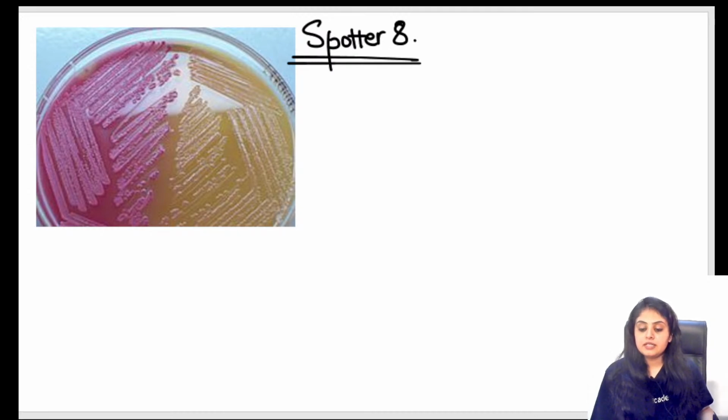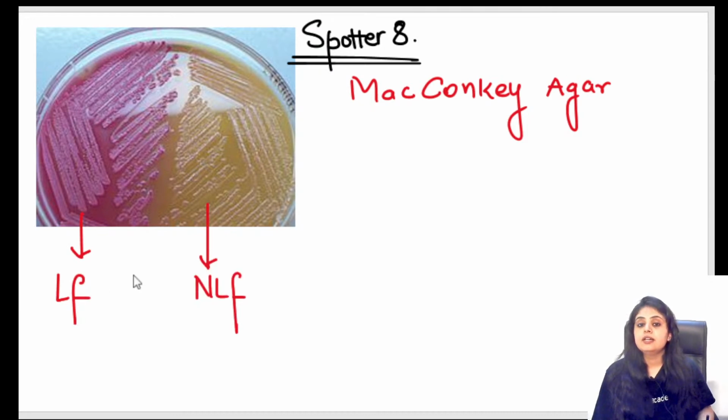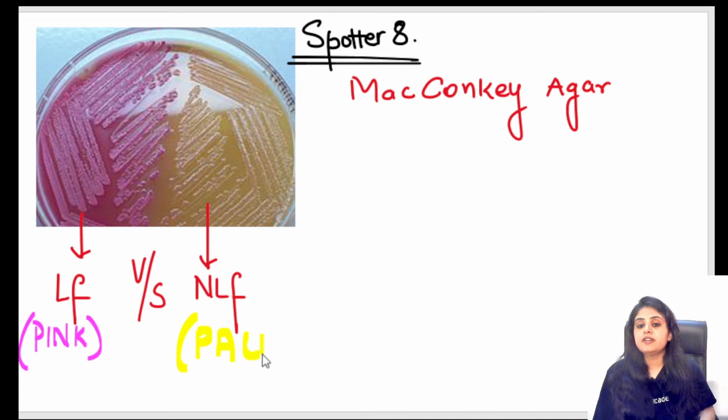Okay, so a very, very important question, I suppose, which comes in many, many exams. MacConkey agar. Yes, this is definitely a MacConkey agar. Tell me the utility. When in microbiology will I use a MacConkey agar? When I want to find out whether an organism is a lactose fermenter or a non-lactose fermenter. When I want to do the differentiation between a lactose fermenter versus a non-lactose fermenter, I use a MacConkey agar, and it's in front of you. Lactose fermenter is giving what color? Lactose fermenters give a pink color, whereas non-lactose fermenters give a very pale color.